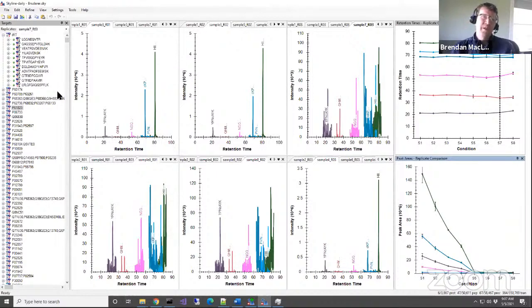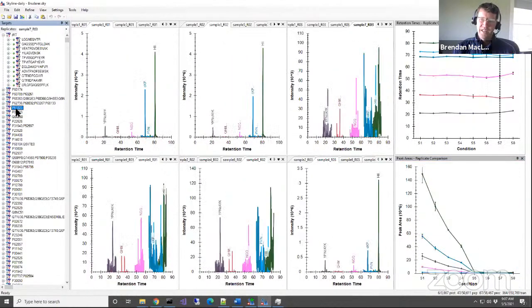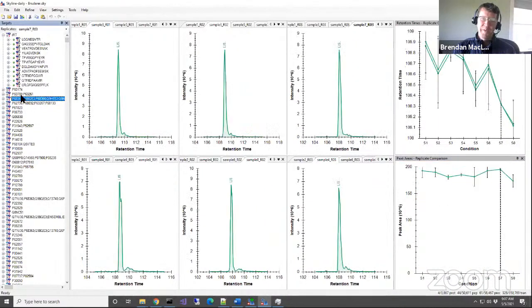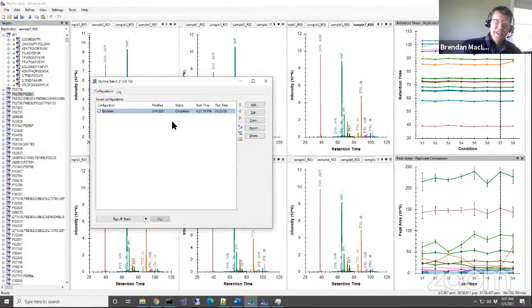we can get some descriptive information about the kinds of things that we'll see in MSstats when we come back to MSstats. But before we go into that, I'm actually not going to review this data very much. Hopefully you have done this experiment, and if you didn't get all the way through this Skyline batch, I encourage you to keep working on it.